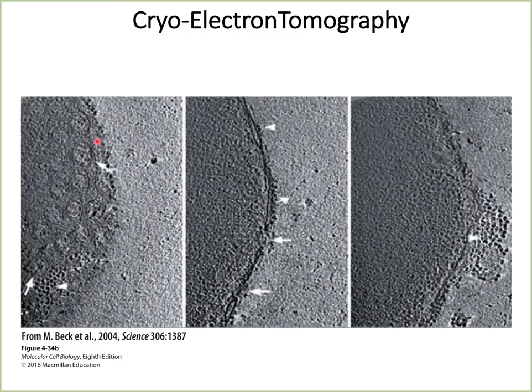So here you can see cryo-electron tomography. We were looking at this sample, which is a nuclear pore complex. If you very carefully look, you can see these tiny nuclear complexes right here. You can see those. On the other hand, this is a much more enhanced picture, at much higher magnification, where you can see the picture of the nuclear pore complex, just one of them right here.